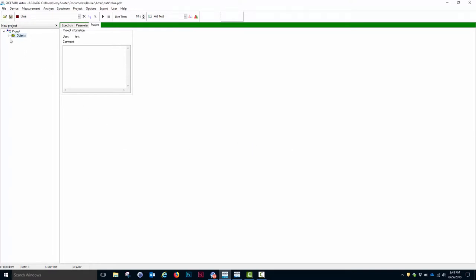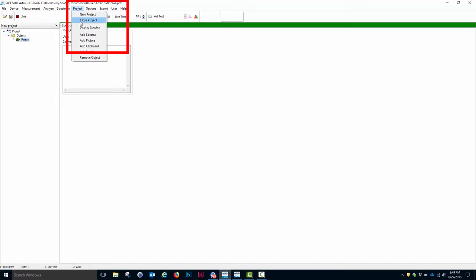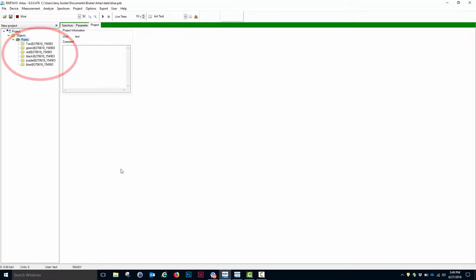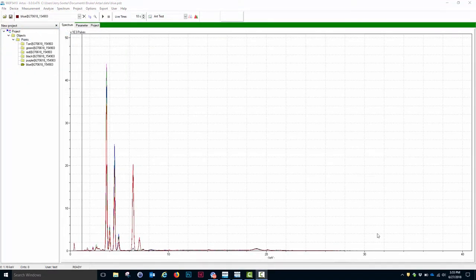So in the Objects, I now have a Points folder. What I want to do is I want to add all of the spectra to that Points folder, and I do that by going to Project, Add Spectra. At this point, my Points folder now contains all of the spectra I have accumulated. We are now ready to analyze the data.